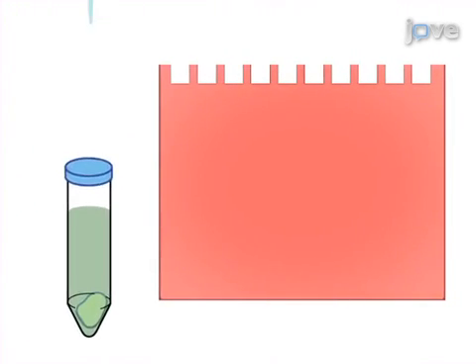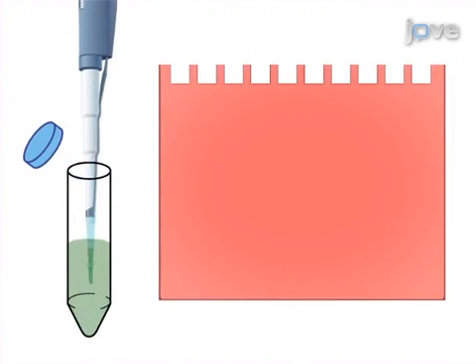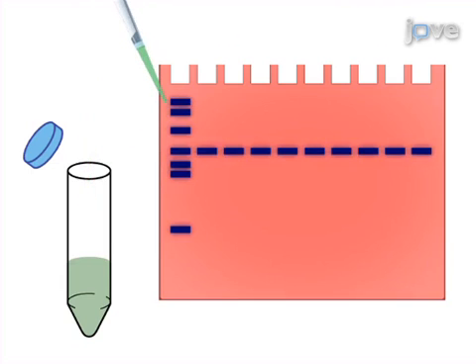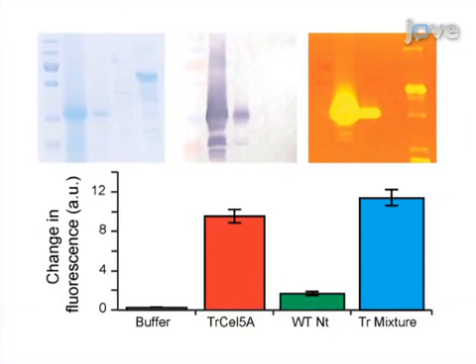Next, protein analysis is performed in order to assess the effects of plant-based expression on the enzyme and to verify its enzymatic activity. Results are obtained that show protein size, possible glycosylation effects, and enzymatic activity based on Western blotting, zymography, and substrate degradation assays.